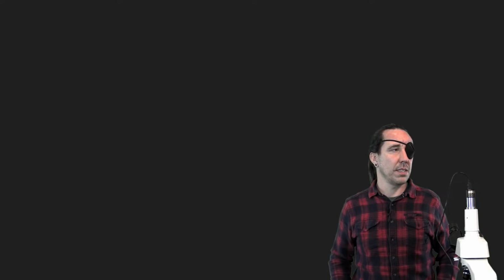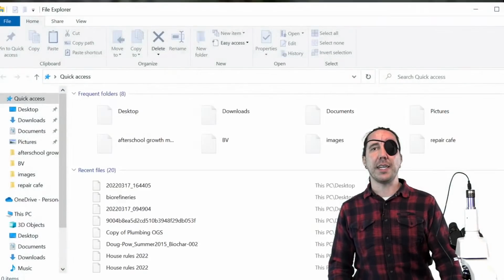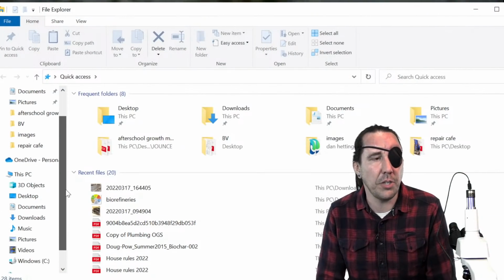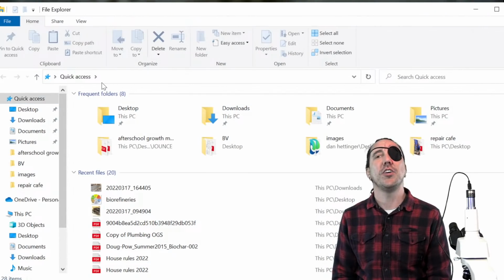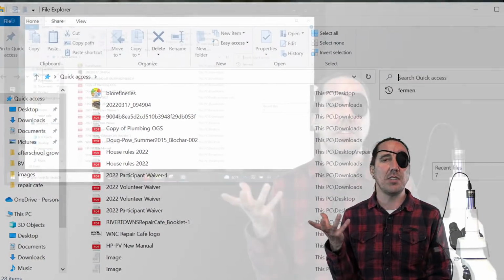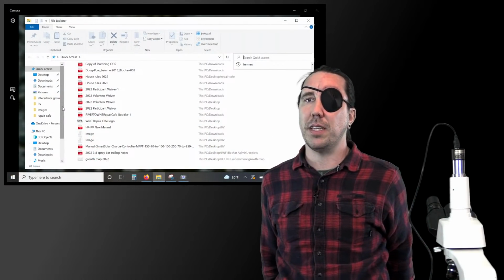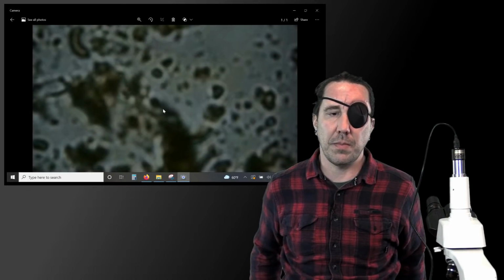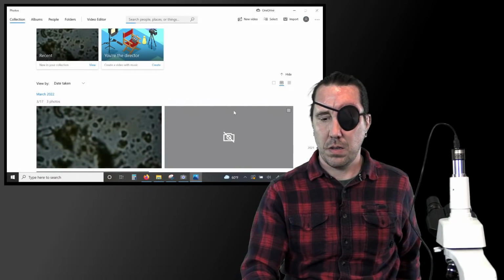Another thing here, this is completely off topic from soil, but I'm looking at my hydro system, and you can see a lot of salt crystals, which might be kind of interesting. Dan's looking at a hydroponic sample that he's using, with human urine as a form of nitrogen. He said he's got some salts that are visible. Usually salts look like the minerals that I was pointing out. They'll just be fragmented pieces in your sample that are clear or generally light colored.